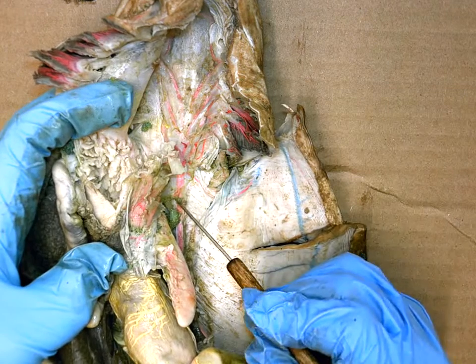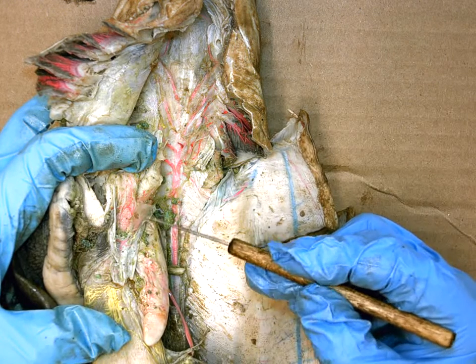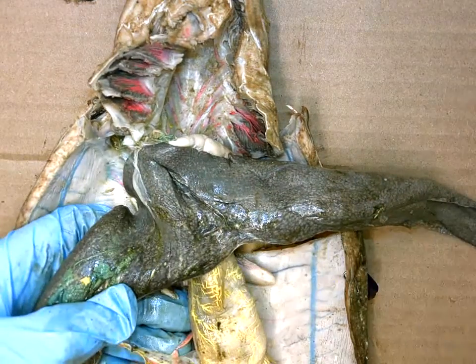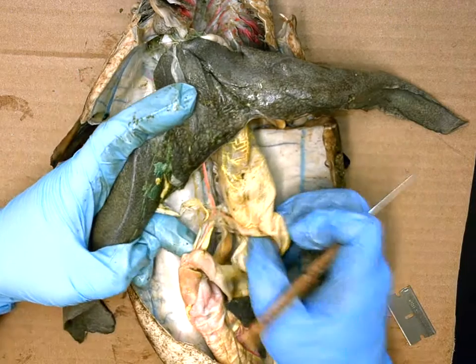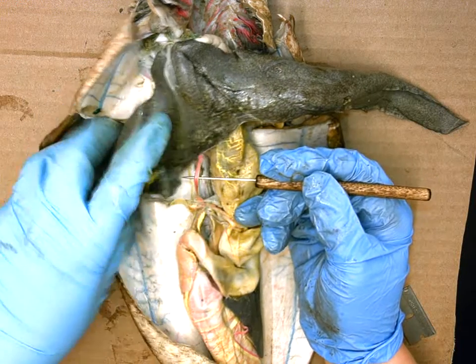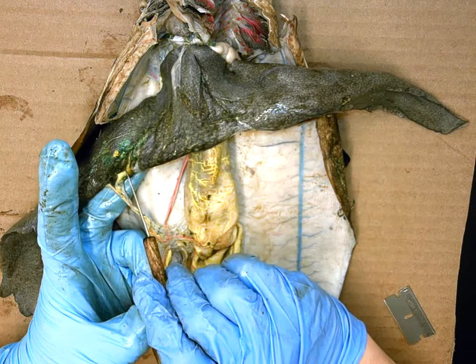There is a branch here that has been severed — there should be a large pink branch coming up into the coelom. Its first branch off would go to the male gonad; these small pink vessels feeding the gonad are called the gonadal arteries. Zooming out, we can see the arteries come to a four-way crossroads. Coming up from underneath the liver is the celiac artery, which branches in three directions. One pink branch goes up to the liver and is called the hepatic artery.